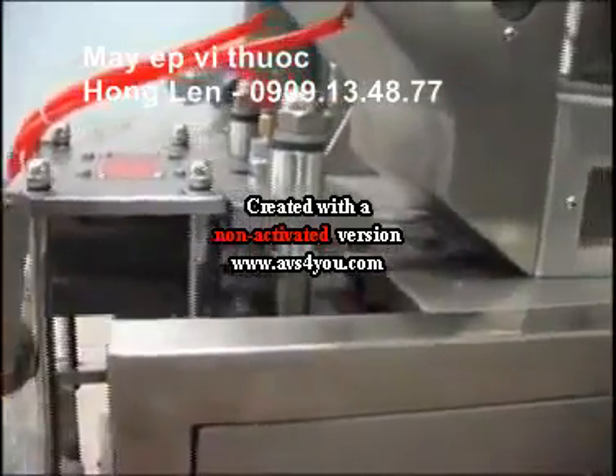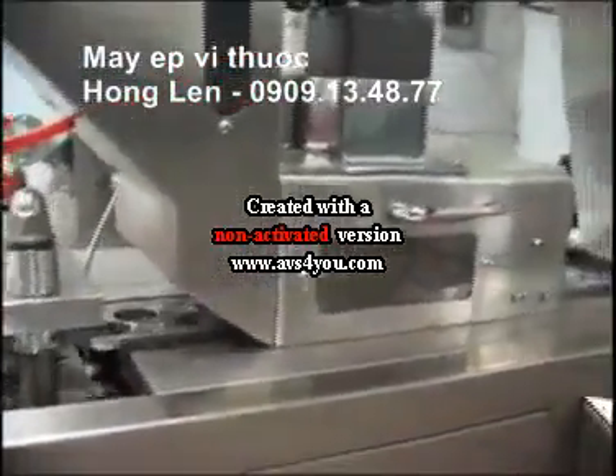The foaming and sealing section of this machine is provided with a flat plate structure and positive pressure.